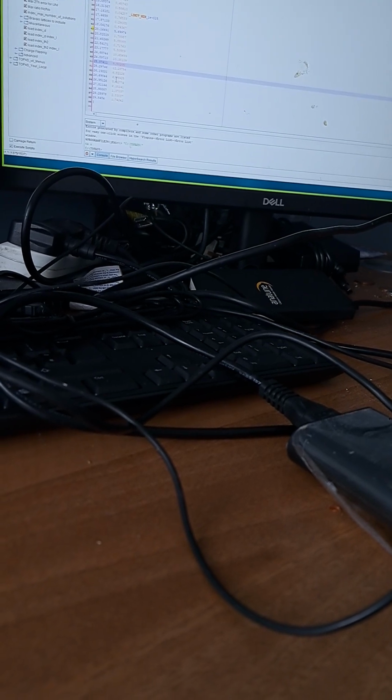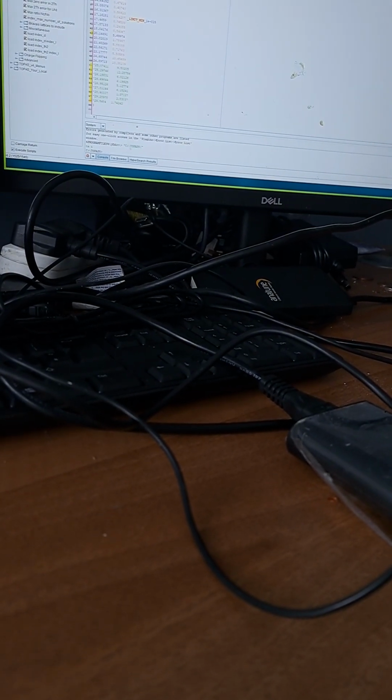Right, so here we go. Say, for example, I'm just going to put a comma like that. That means the program's going to ignore it. So that's 1, 2, 3, 4, 5, 6, 8, 9, 10, 11, 12, 13, 14, 15, 16, 17, 18, 19, 20, 21. Okay, right, let's just do that. So you just put apostrophe? Yeah. Okay.